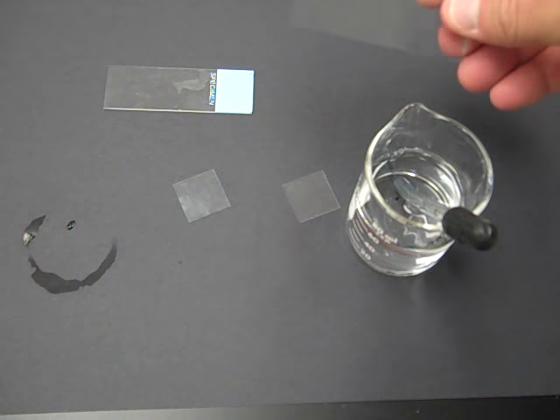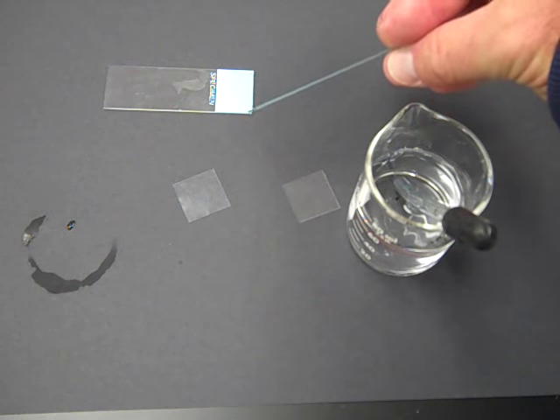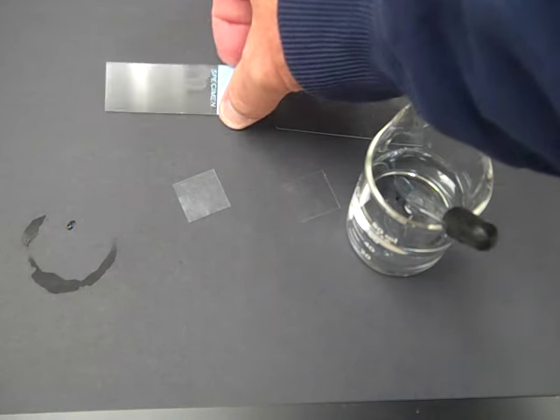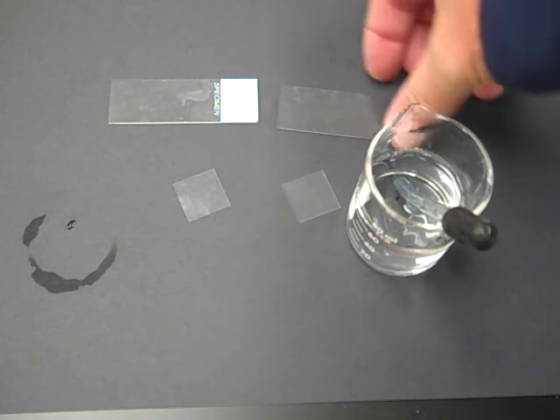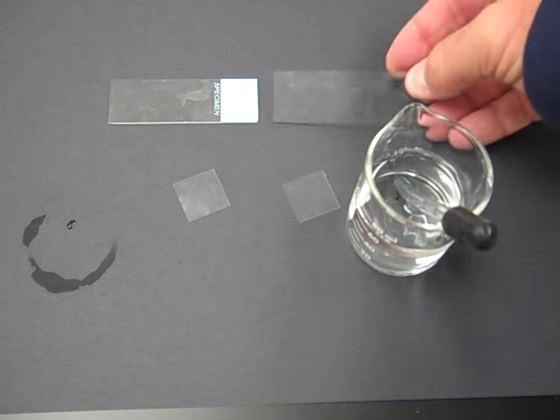The bigger object is the slide. These are glass, so be very careful with them. Some have a blue tint on the end and some are just clear.